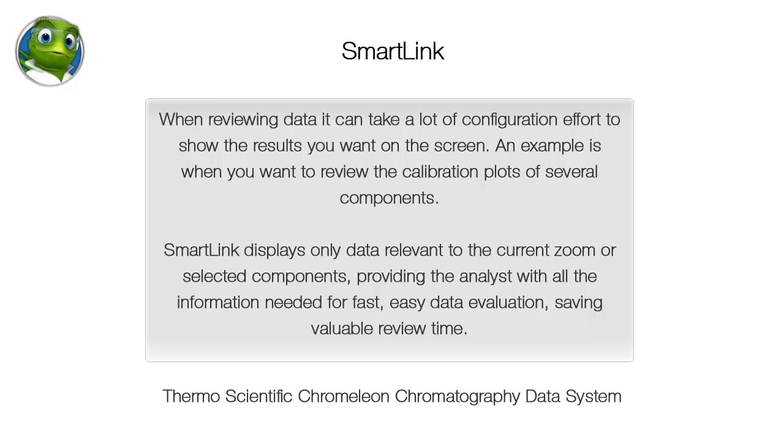SmartLink displays only data relevant to the current zoom or selected components, providing the analyst with all the information needed for fast, easy data evaluation, saving valuable review time.